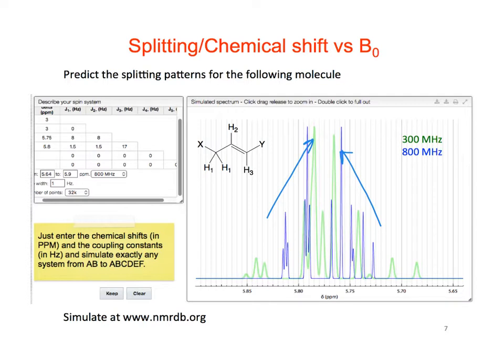So you have to take the average of those two peaks to get the chemical shift. If it's just a triplet, then you can just take the tip of this peak. Or if we have this doublet of triplets, we take the one in the middle of both triplets.